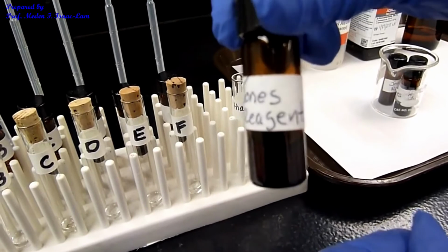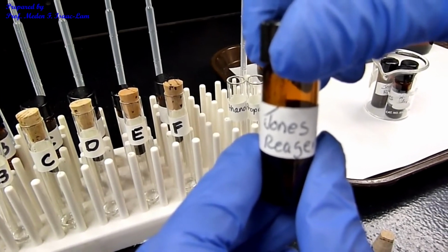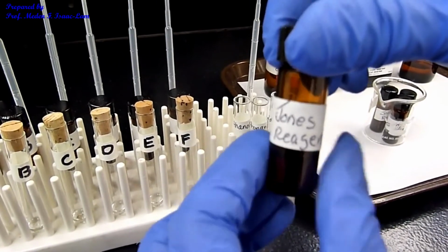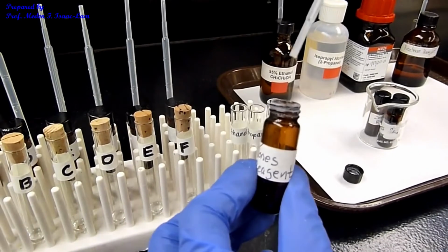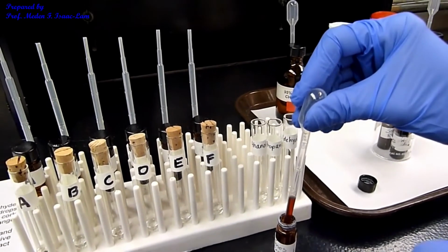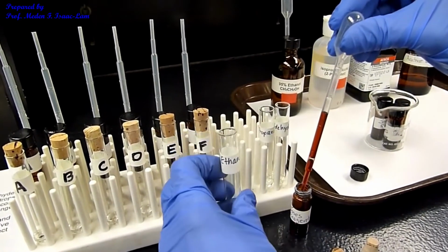So this is the Jones reagent. This is actually CrO3 or chromium oxide. So this is chromium oxide, chromium plus 6 is the oxidizing agent. The reagent is orange in color. Okay, and then I will add, so we will take note of the time that it takes to react. So ethanol should react and 2-propanol as well as anisaldehyde.